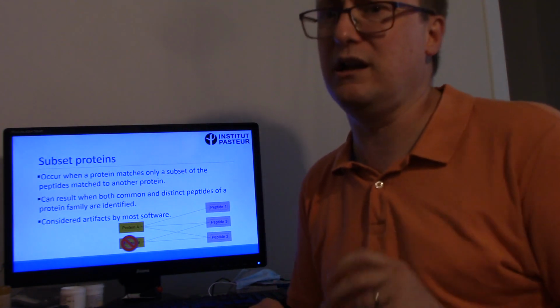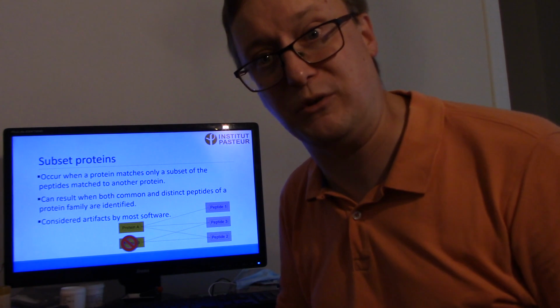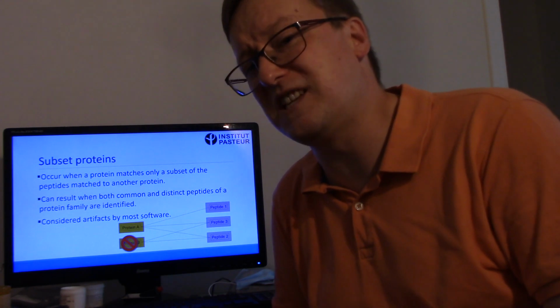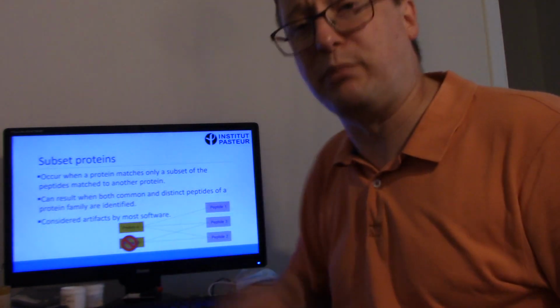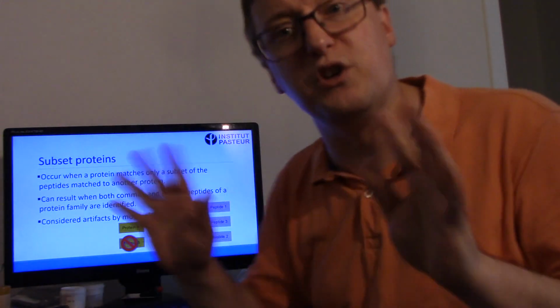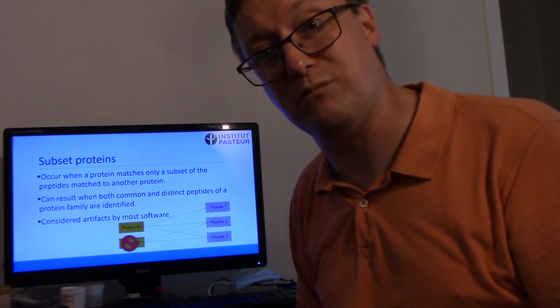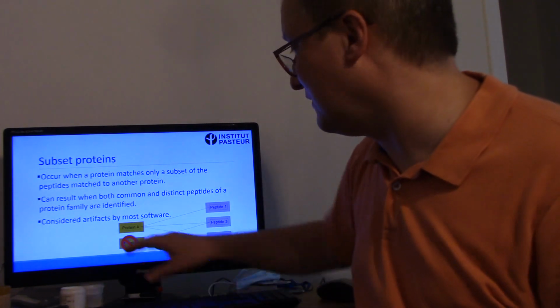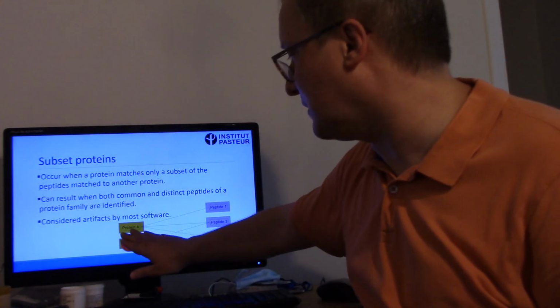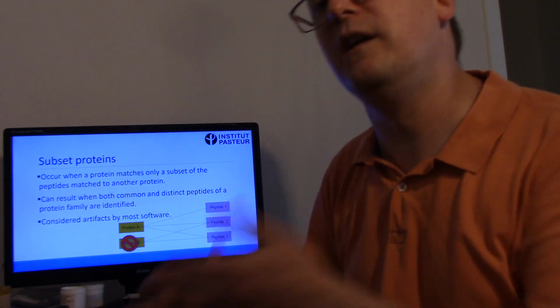No way. No way. We do not prove that proteins are absent by shotgun tandem mass spectrometry. We always assume that there's some set of proteins that are present that we just didn't have enough sensitivity to reach. So it's possible protein B was there. And in fact, if we do another experiment, we might just randomly, even if we're using exactly the same samples, we might this time detect a peptide that could only be explained by protein B. And it would look pretty silly, wouldn't it, to say we've claimed protein B was not present. Okay, so B is typically stripped away, is hidden from us, because protein A explains more of the data than protein B does.